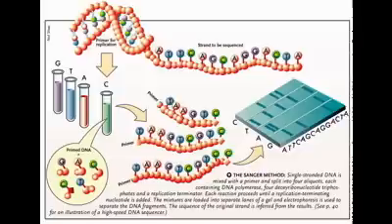This is a spin column, and that will actually spin it down for 5 minutes in a centrifuge, and then you'll basically run a buffer through it, a chaotropic buffer, and then once that's clean, you will run RNase-free water through the spin column in order to get your final amount of nanograms per microliter of DNA that you're going to get.